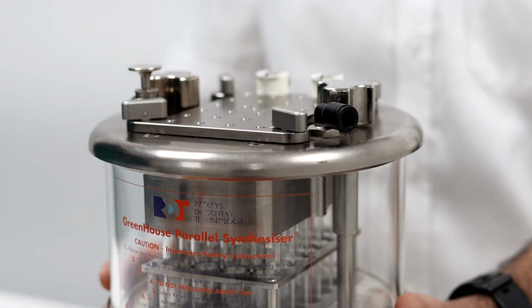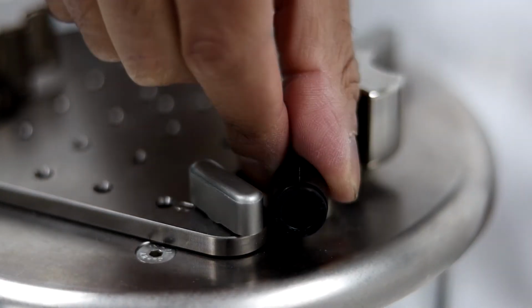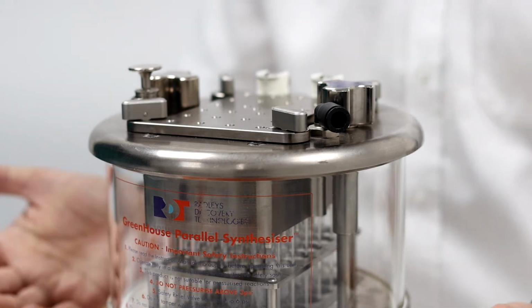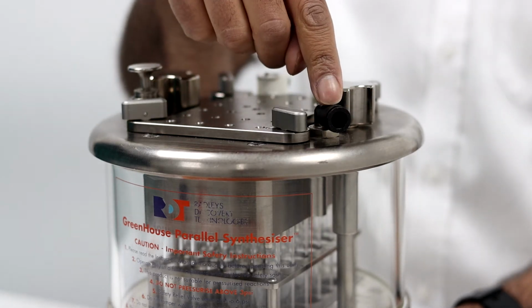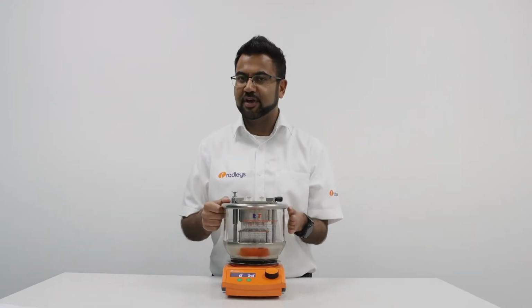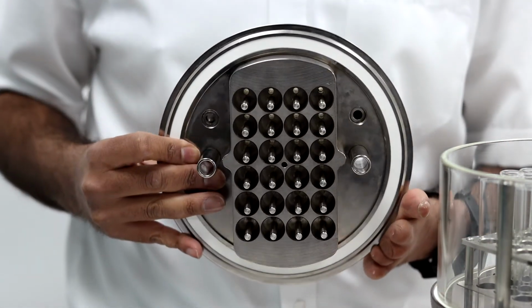You connect your gas source using this hose barb. You might want to use a three-way valve to connect the GreenHouse to a regulated inert gas supply and a vacuum source for purging. By switching 3 times between the vacuum and inert gas, you can purge air from the system. Connect your water inlet and outlet into these quick release connectors into the head. For refluxing within the GreenHouse synthesizer, the reflux head contains a series of nickel pins that act as cold traps.